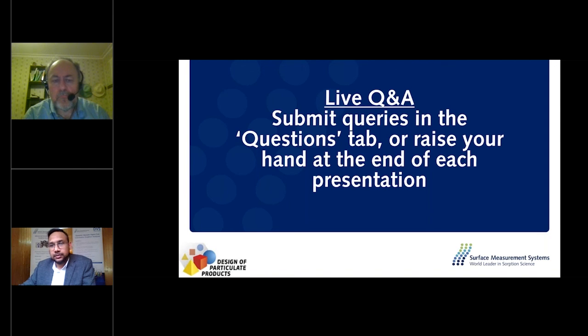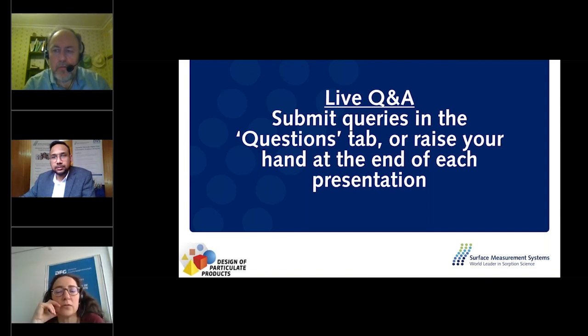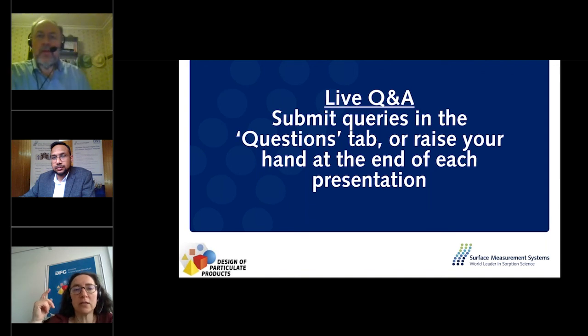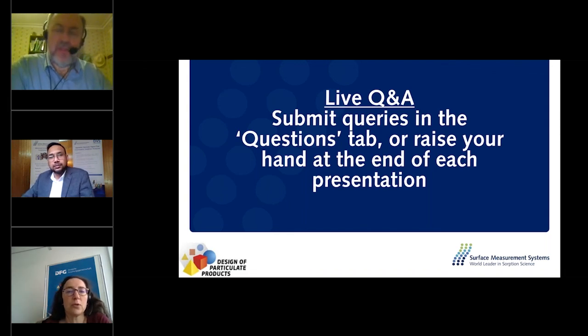Yes, thank you very much for your presentation, first of all. So the question was, the second part of it, it's about the measuring in principle of the acidity constant of these OH groups. Because in some materials, especially in oxyhydroxides, the acidity constants of OH groups are not equivalent. So there are groups that are bound to three metals and OH groups that have only one metal bound, and they have different acidity. And I was wondering whether these techniques can shed light on this very complex problem.